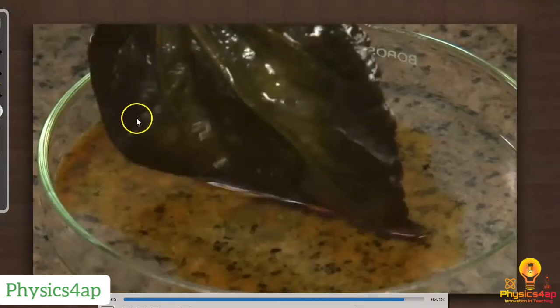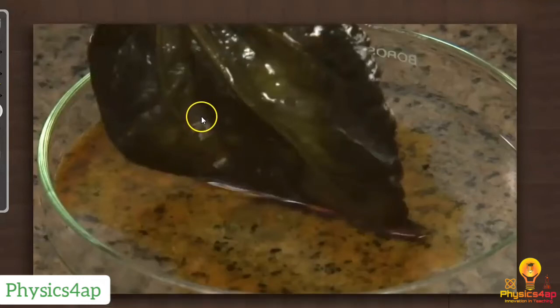For the procedure, we write everything we have explained so far. In the conclusion we write that as starch is present in the leaf, the iodine changes to blue black or violet color. By the change of color of the iodine solution, we can say that starch is present in the leaf. For the precautions: boil the leaf carefully and handle the chemicals with care. Alcohol is used to remove the chlorophyll present inside the leaf.